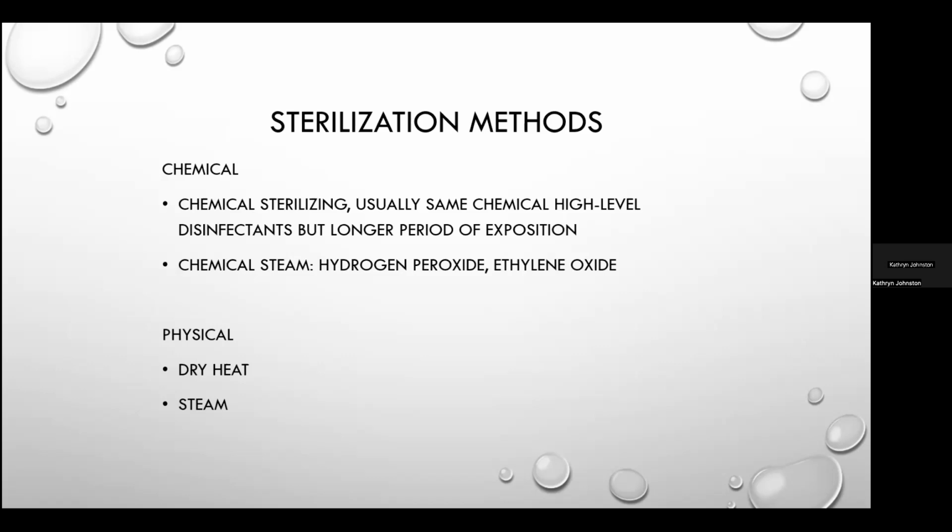for sterilization. And then sterilization by immersion in liquid chemical methods can be carried out manually, but it is the last method of choice. The reason is that it's difficult to control those processes, and there is a great possibility of recontamination during rinsing or drying, and it doesn't allow for any packaging or storing.